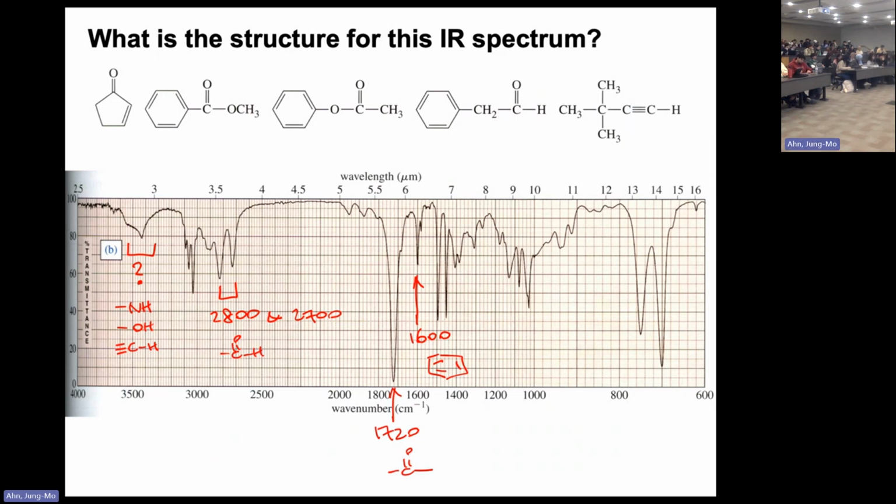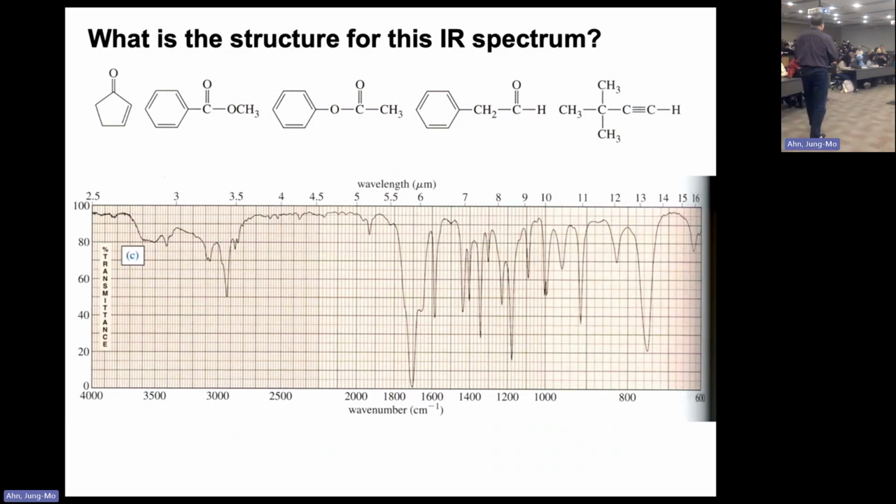If you have a really strong carbonyl signal, there could be a harmonic showing up at 3400. Don't get fooled by that, because if you think this is real, then you're going to look for the amine, and maybe there was some amine in the example, you're probably going to choose that one, and that's a wrong answer. So you've got to be careful reading that. That's one of the things I'm pointing out. But this is the one that you really have to look into.